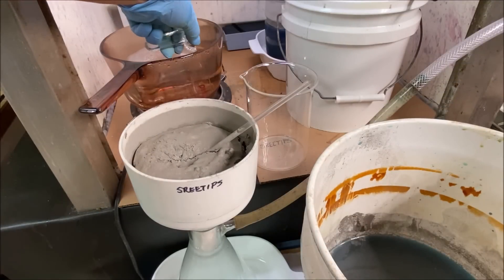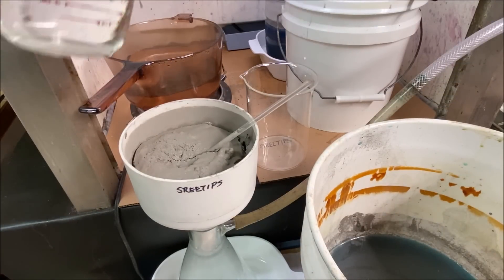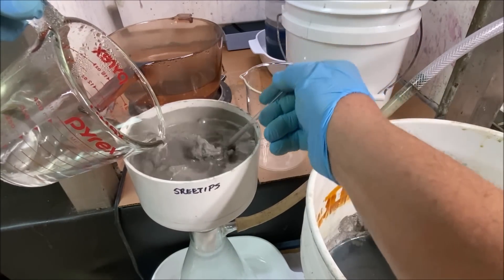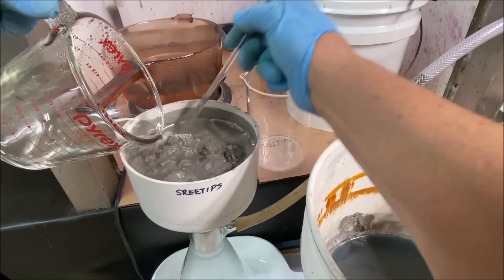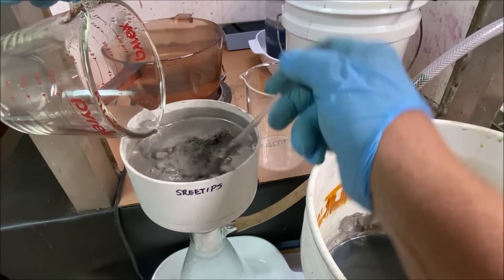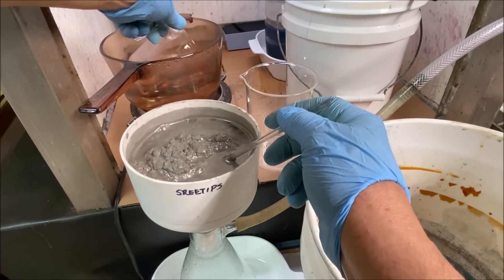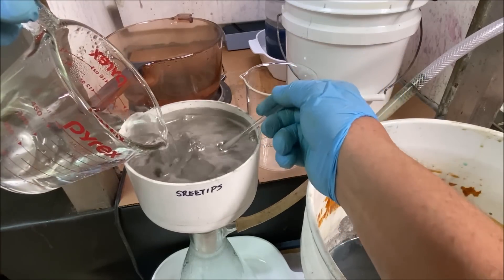I've reestablished the vacuum to this flask and we're going to continue adding boiling distilled water to get all the copper solution rinsed off our cement silver. The longer we spend rinsing the copper off, the less copper there will be that must be dealt with when we melt this up into shot and run it through the silver cell.